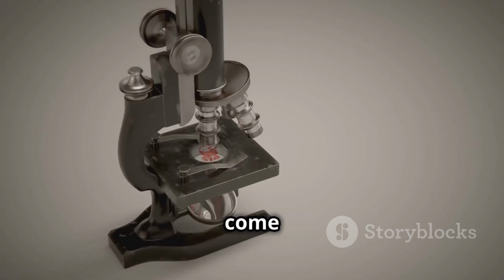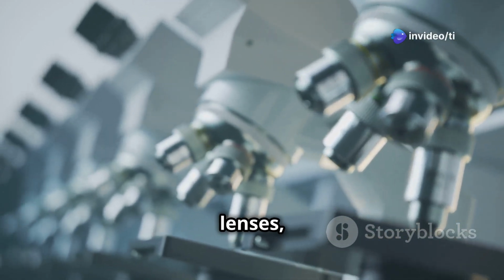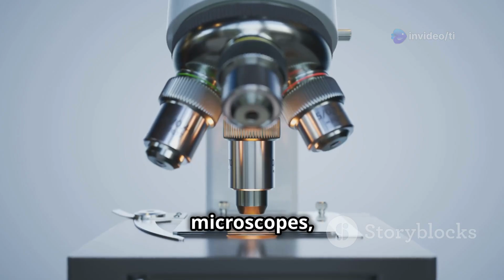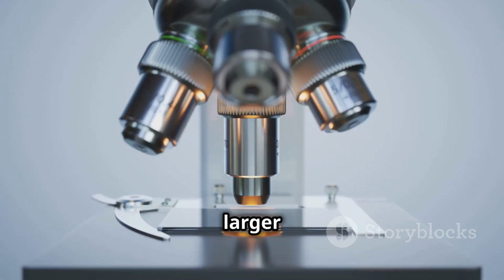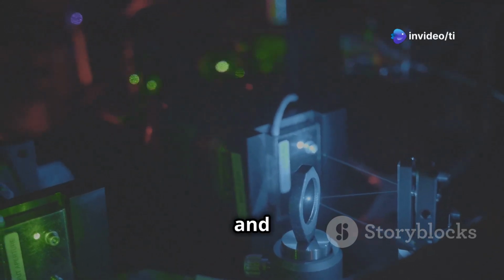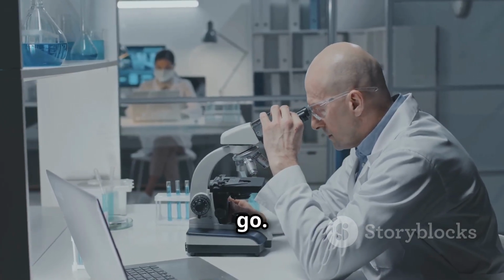Light microscopes come in various forms, each with unique capabilities. Compound microscopes, with their multiple lenses, offer high magnification for observing tiny structures like cells and bacteria. Stereo microscopes, on the other hand, provide a three-dimensional view, ideal for examining larger specimens like insects or minerals. Digital microscopes connect to computers, allowing for easy viewing and sharing of images. Pocket microscopes are portable and perfect for fieldwork, offering quick magnification on the go.